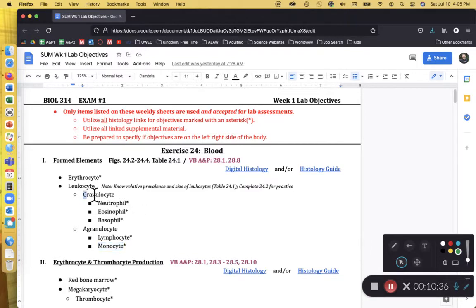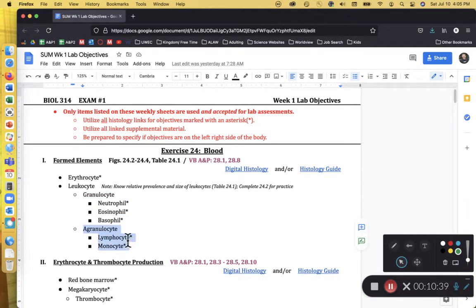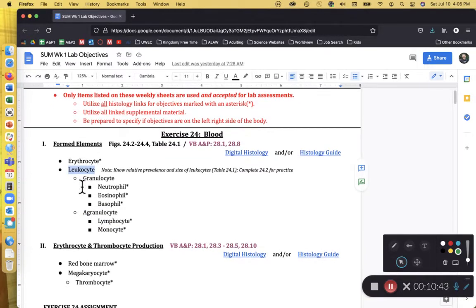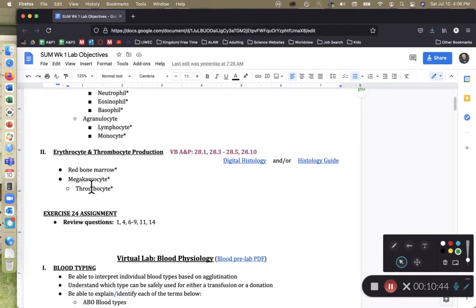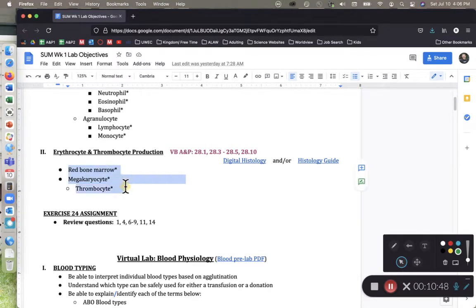We've covered all the granulocytes and all of the agranulocytes. That means we've covered every single leukocyte you need to know for your lab exam. Let's move on to red bone marrow and megakaryocytes.